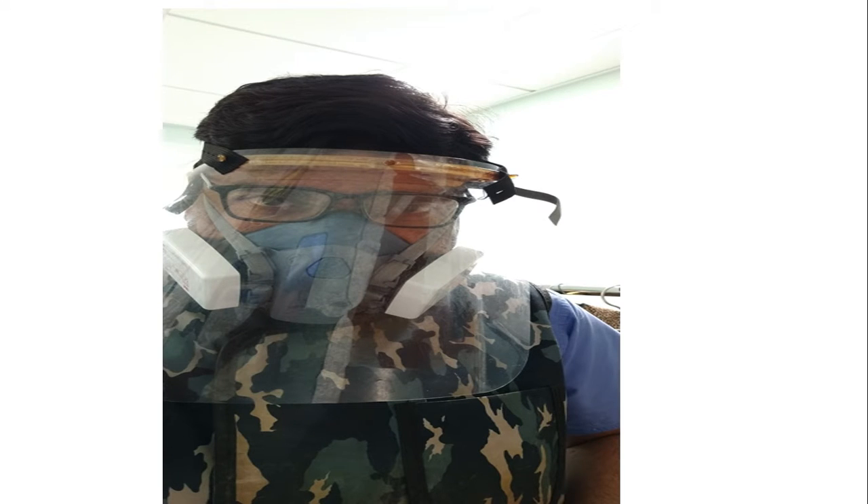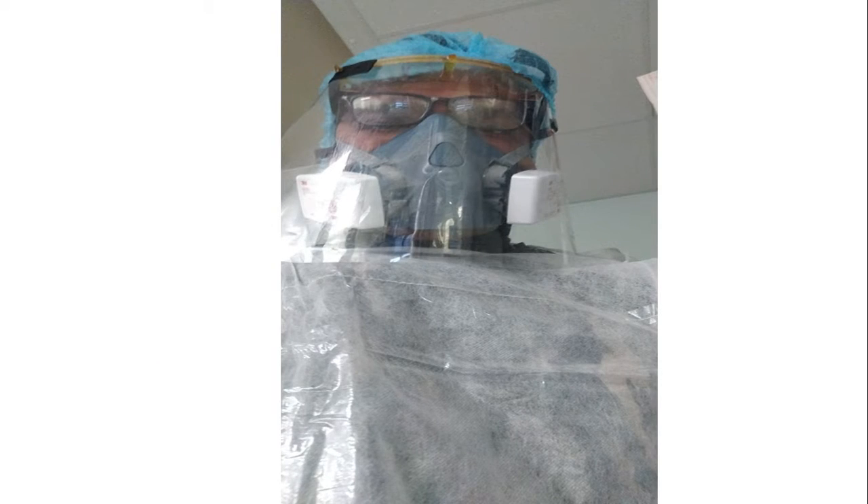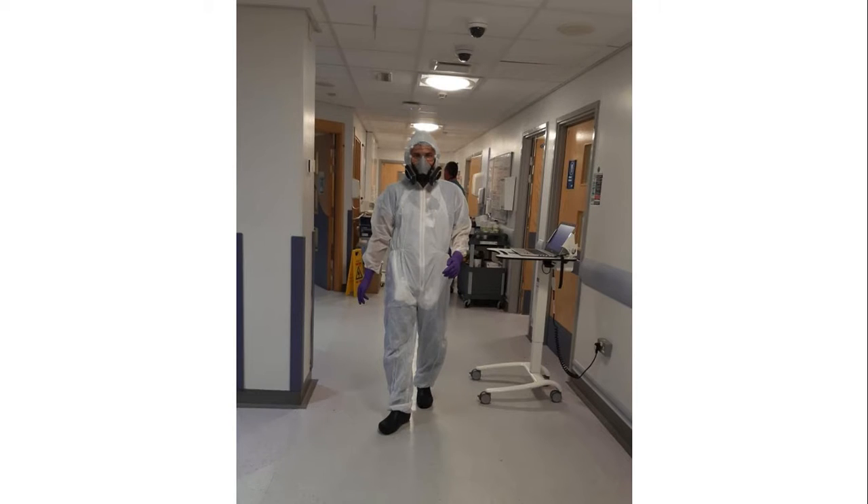Different masks exist for different purposes, and that is one of the reasons we use such special kinds in special times like COVID. These reusable models can be used again and again, but only after taking special precautions during donning and doffing and cleaning with antiseptic fluid. In high-risk areas such as the intensive care unit, these equipments can be used combined with a non-sterile suit. Overall, this is how the setup looks.